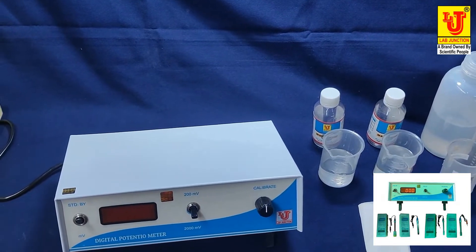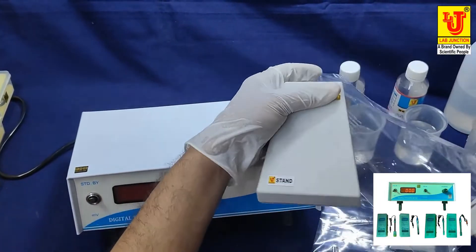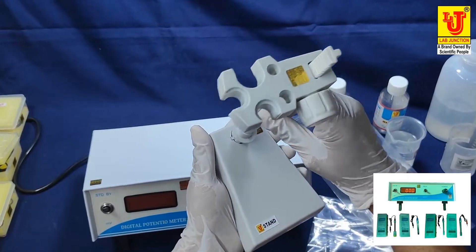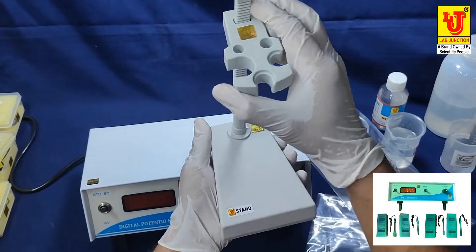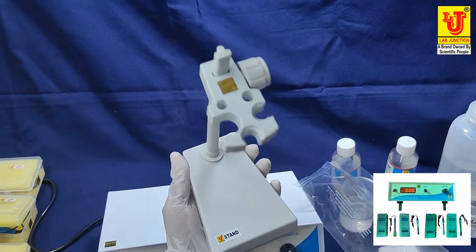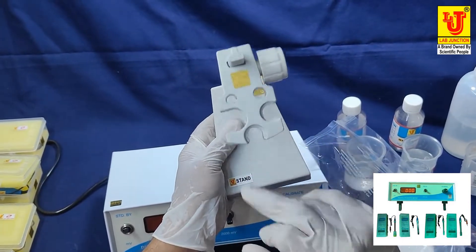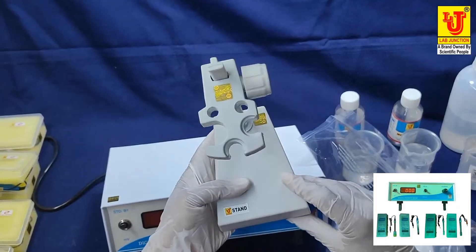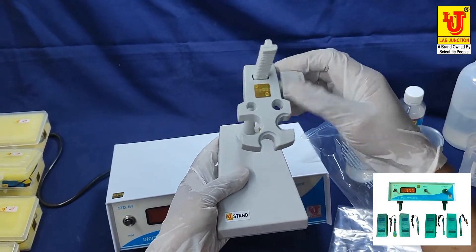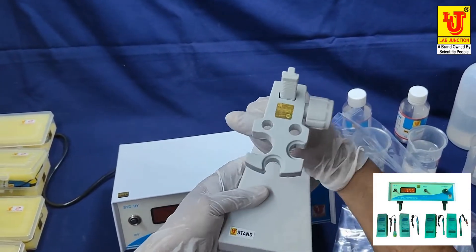This is the stand. You insert the locks like this and move it — now it stands steady. This is used for hanging your electrodes in the clamps. If you want to move the clamps, you move them up or down like this.